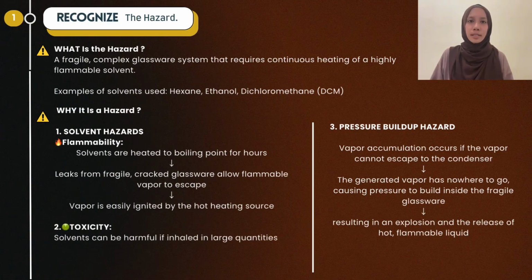Second point is the toxicity. So if we inhale too much of that solvent, it can cause harm. For instance, if we use DCM as our solvent and we inhale too much of it, then it can cause carcinogenic effect.